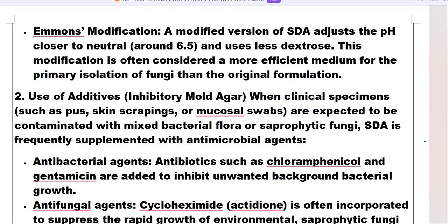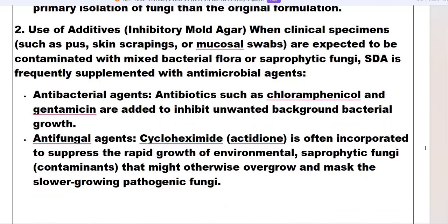Use of additives. Inhibitory mold agar. When clinical specimens such as pus, skin scrapings, or mucosal swabs are expected to be contaminated with mixed bacterial flora or saprophytic fungi, SDA is frequently supplemented with antimicrobial agents.